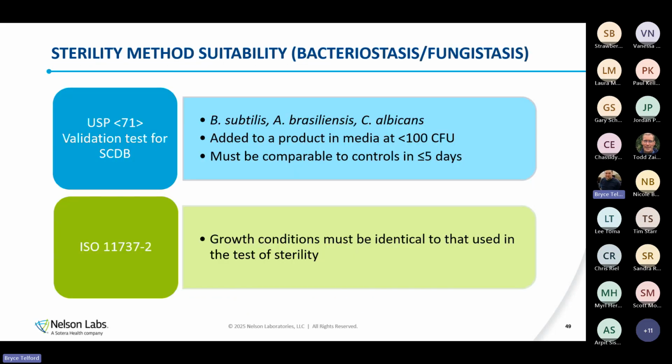So let's talk about BF a little bit more, because just like recovery efficiency, your dose setting and how the dose is set flows through that recovery efficiency and that bioburden estimate. Your test of sterility is really only valid with an acceptable BF test, bacteriostasis fungistasis, also called the sterility method suitability.